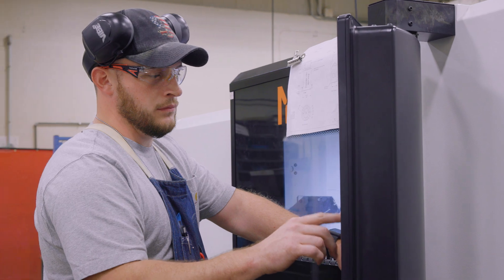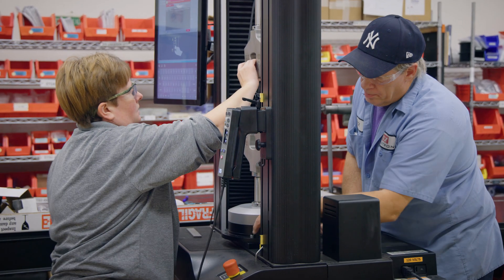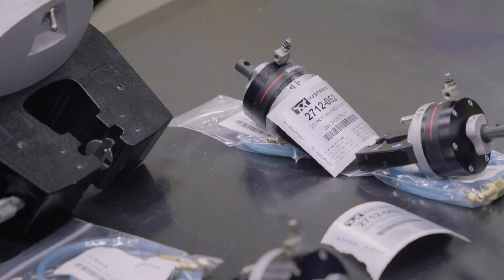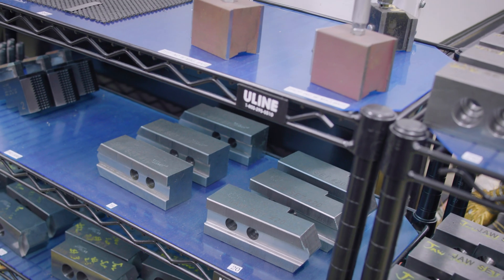Our Binghamton facility also produces hundreds of load string accessories used on Instron universal testing systems, including pneumatic grips, bend fixtures, adapters, and more.